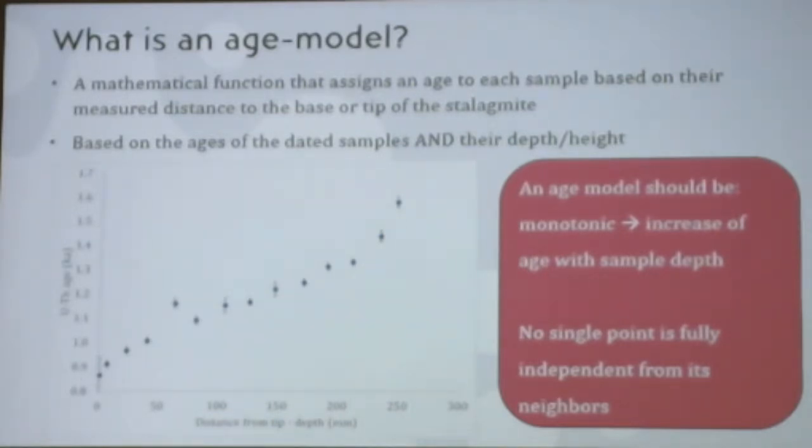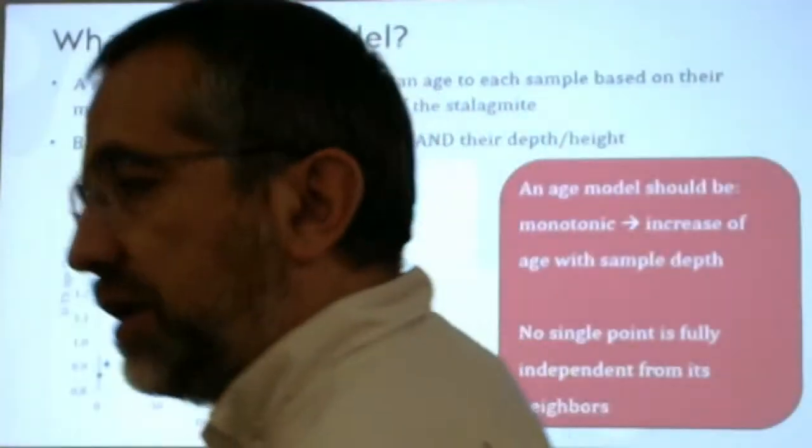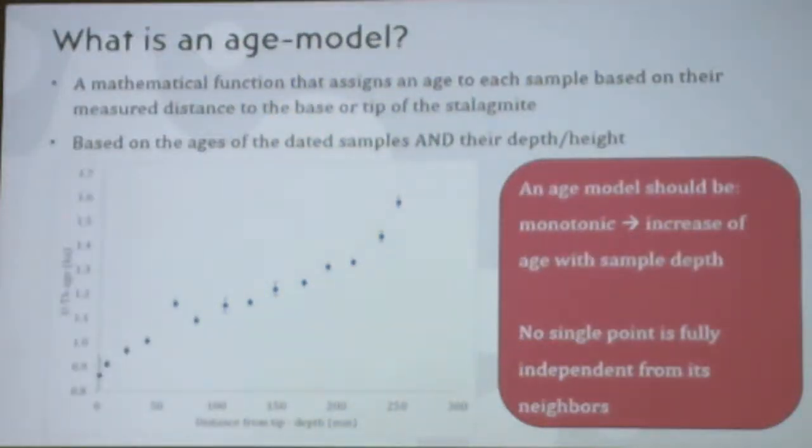And the other important thing is that no single point is independent. Even though you dated them independently, they are not completely independent because growth rates don't vary quite significantly. They're not very variable in stalagmites, so they're kind of related.